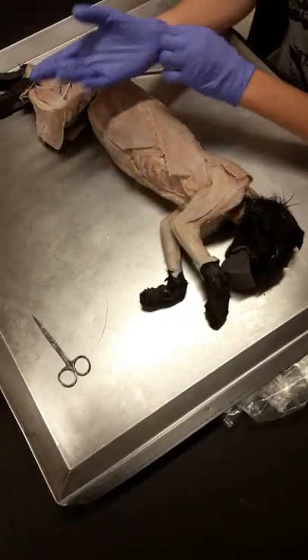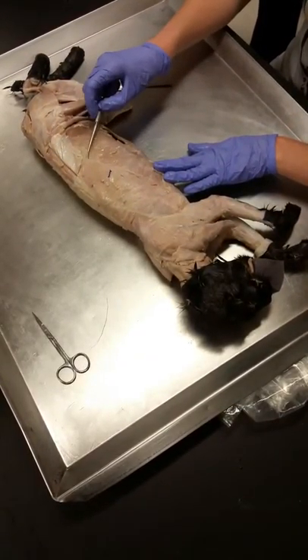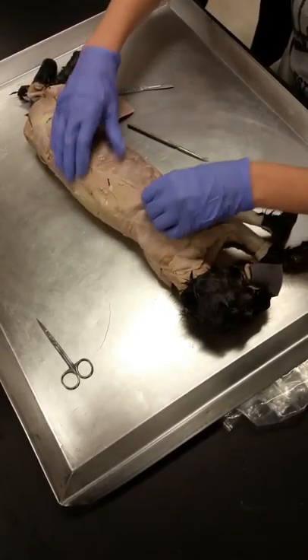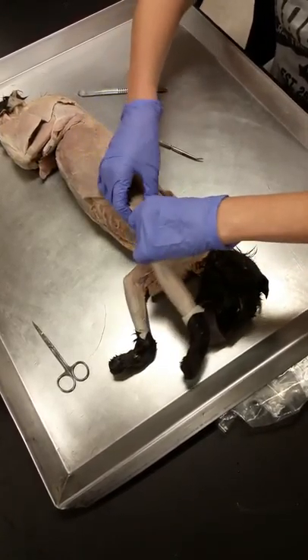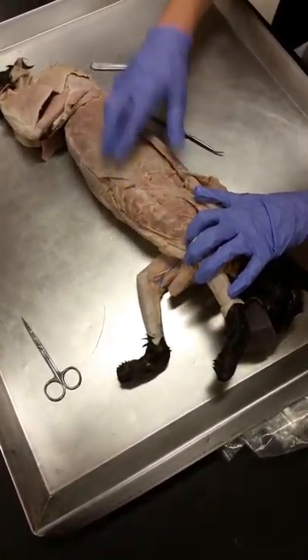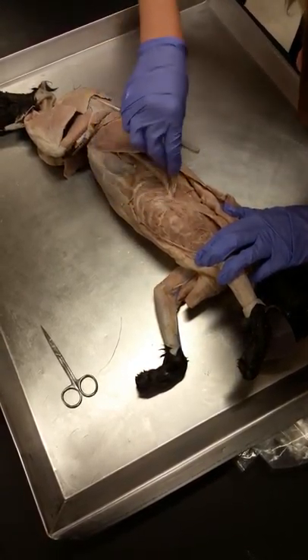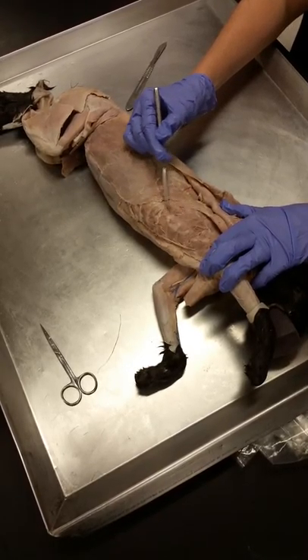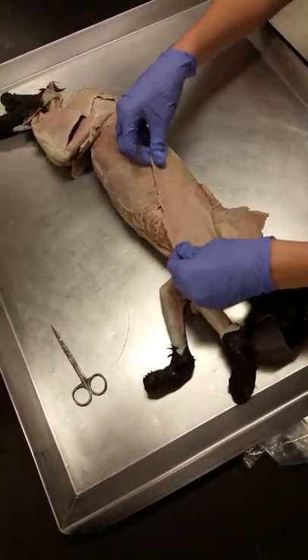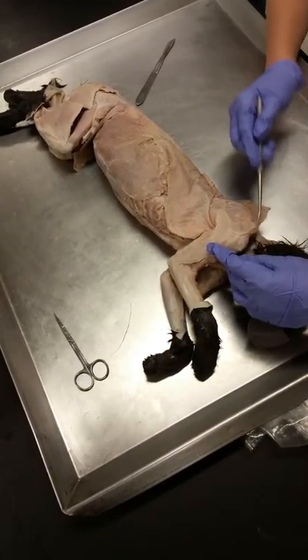Then the next thing you want to do is get your latissimus dorsi. Latissimus dorsi is the big sheet on the side of the cat — just find the edge of it with your probe and pry it off. Underneath latissimus, there's this one that people think looks like a serrated edge of a knife — that's serratus anterior. So this right here is serratus anterior, and this one is latissimus dorsi.